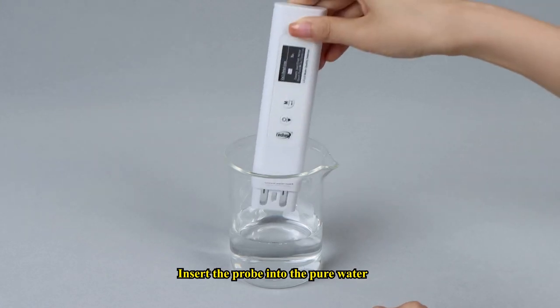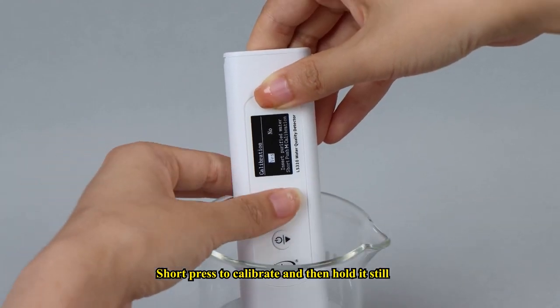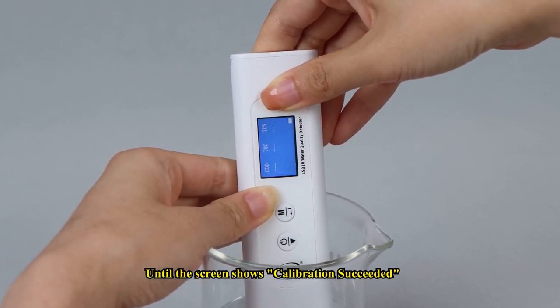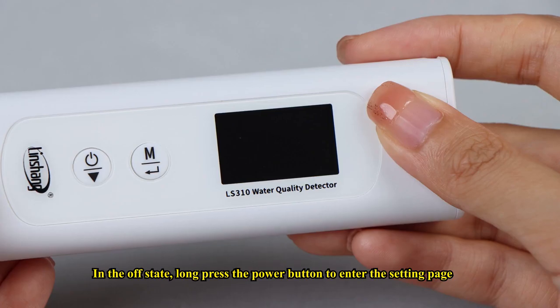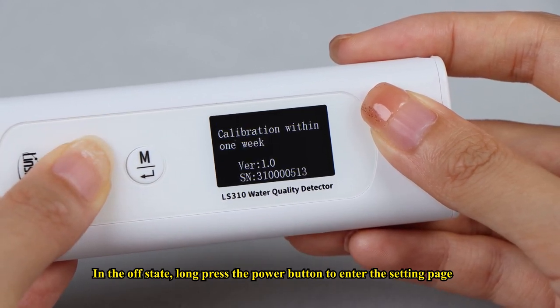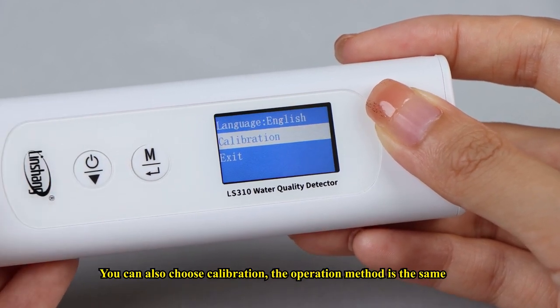Insert the probe into the pure water, just past the minimum water level. Short-press to calibrate and then hold it still until the screen shows calibration succeeded. The device automatically jumps back to the measurement interface after successful calibration. Alternatively, in the off state, long-press the power button to enter the setting page where you can also choose calibration — the operation method is the same.